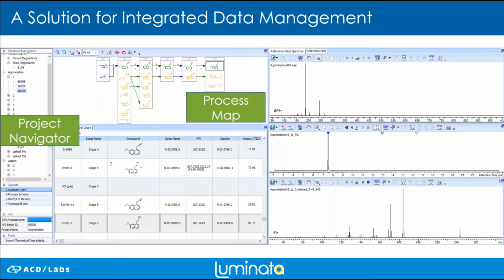The central location is your process map, and I'll dive into this more deeply when I show it in the software. Just like you saw in that image in Excel, we have our whole synthetic route, and down below, you have at every stage all impurities associated per stage. And again, this becomes quite crucial when you're going through this data.